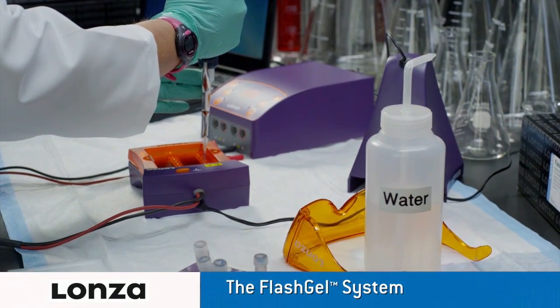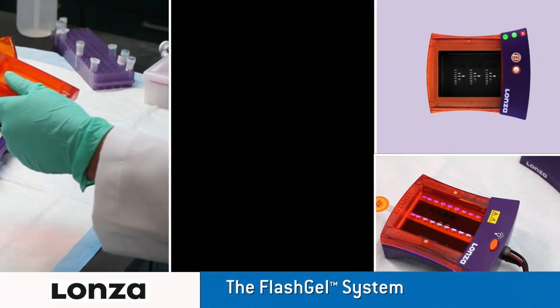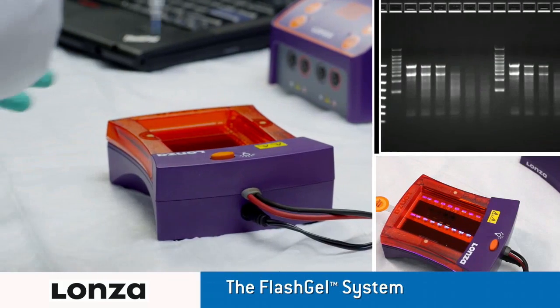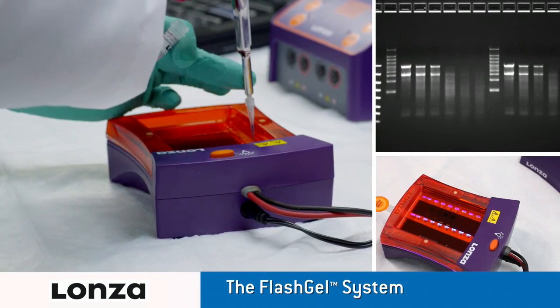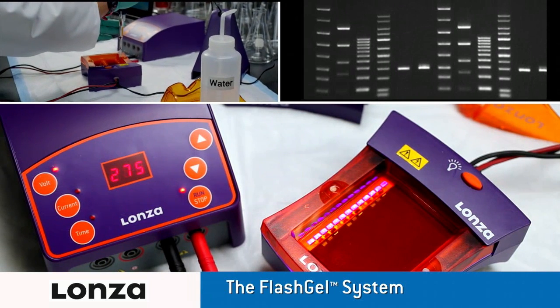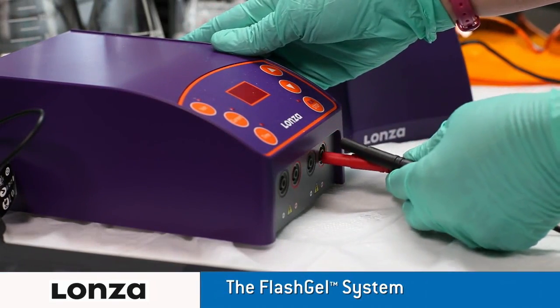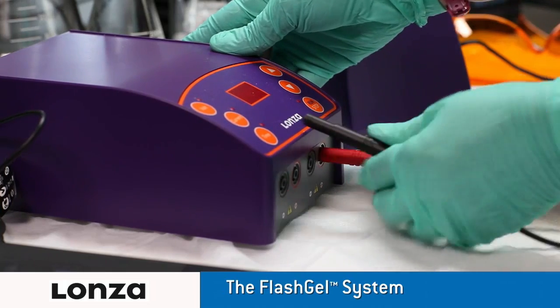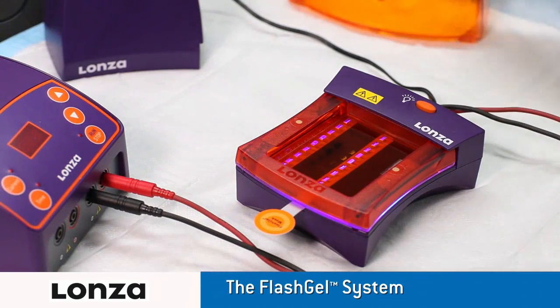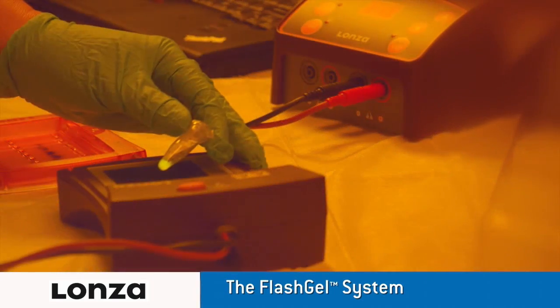The FlashGel system provides complete separation, recovery, and documentation safely in just minutes. Simply load your DNA or RNA samples and watch the bands migrate. The FlashGel system can also recover DNA with an easy pipette extraction and no messy cutting or handling of the gel. With a newly added FlashGel power supply, the FlashGel system is easy, powerful, and complete. Say goodbye to time-consuming gel preparation, band excision, purification, and UV light.